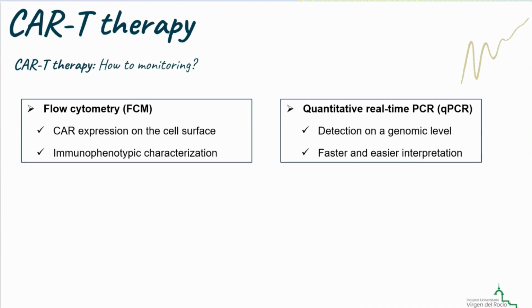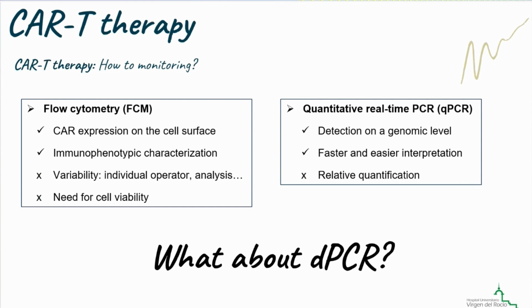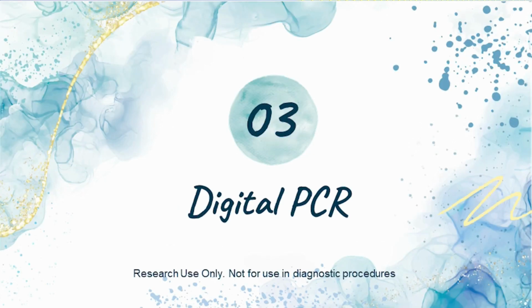For this reason, flow cytometry or quantitative real-time PCR have been proposed for monitoring CAR T therapy, but both techniques have many disadvantages that do not facilitate their introduction in clinical practice. So we thought, what about digital PCR?